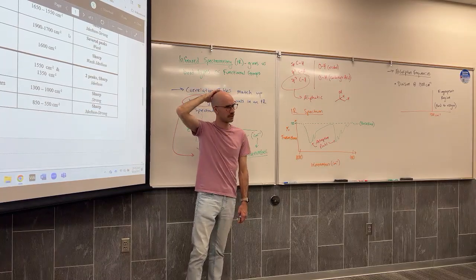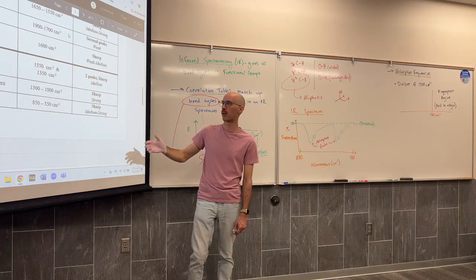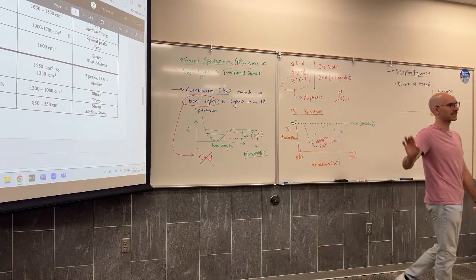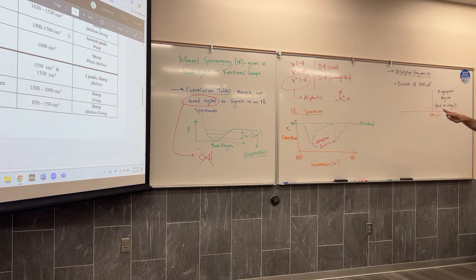I had an OChem 2 lab student. Every week they analyzed their product with IR, and every week in their lab report they said, my product has carbon-halogen bonds because I see absorption in that low frequency region. And I said, why does your product have carbon-halogen bonds when none of the reagents involved halogens at all? They said, I saw it on the correlation table and I thought that was it. So, trying to make it clear, these three only absorb in the fingerprint. Many other things also absorb in the fingerprint, making these three the hardest to find.